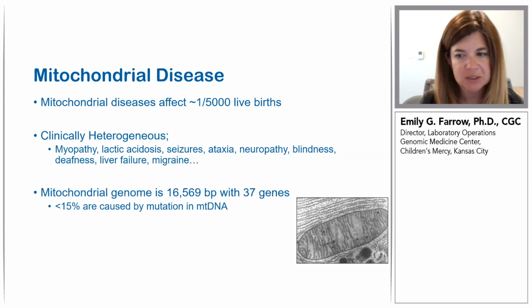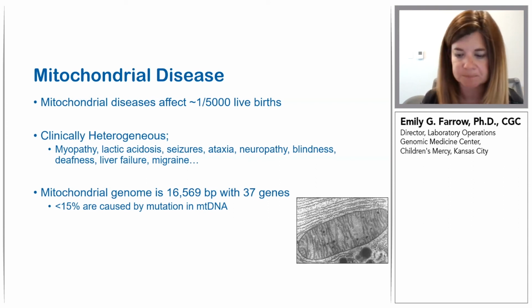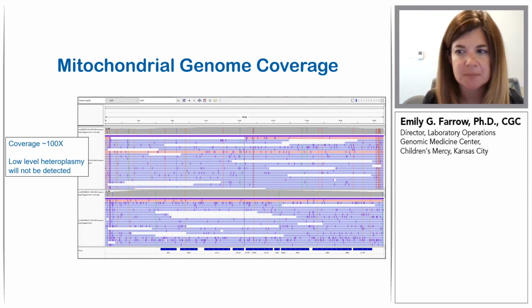With sample preparation modifications in our hands, the HiFi genome now captures the mitochondrial genome with an average coverage of 100 to 200x per sample. So again, using the current automated sample preparation techniques that we have, we've preserved the mitochondrial genome, allowing for a complete analysis. And in some cases, the entire mitochondrial genome is covered in a single HiFi read, providing the ability for accurate copy number variant detection, again, a common disease mechanism.